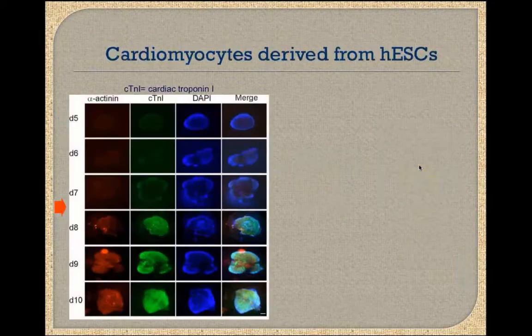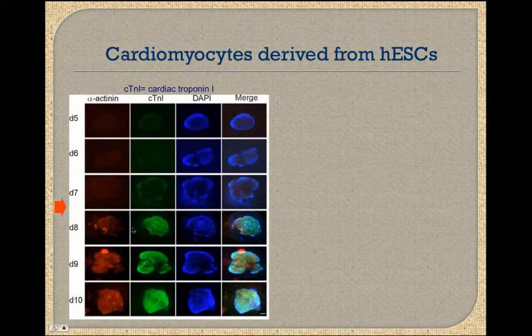We also did some experiments to figure out at what time points we would expect to see the embryoid bodies differentiating towards cardiomyocytes. You can see at day 7 of differentiation, in these fluorescence images on some parallel cultures, the embryoid bodies are expected to have a high abundance of cardiomyocytes. Again, these images are by fluorescence, and at each stage they require fixation. So these are not the same embryoid body. You require different samples for different time points.